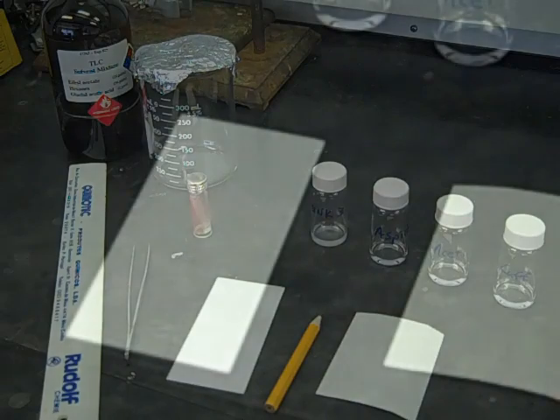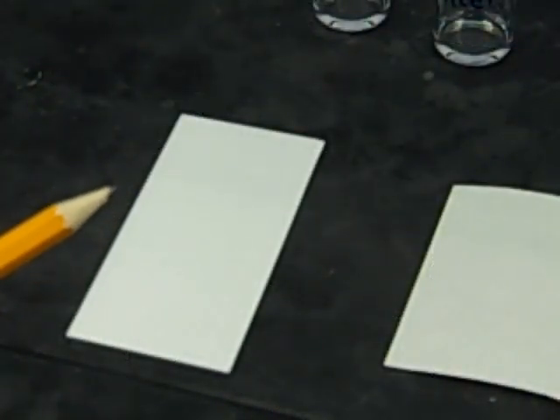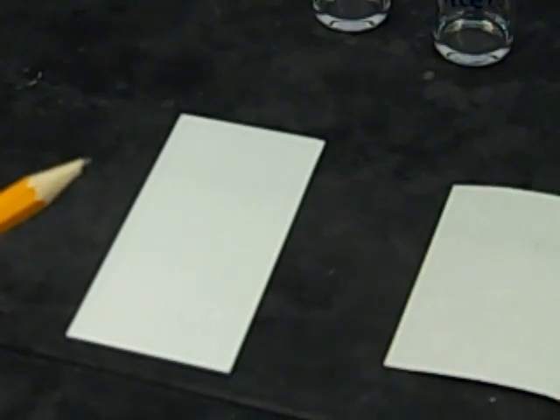All the markings we make need to be in pencil. If you make markings in pen, then all the dyes and binders and everything in that ink are going to separate out and make a mess on your plate. Use pencil, which is made of graphite.